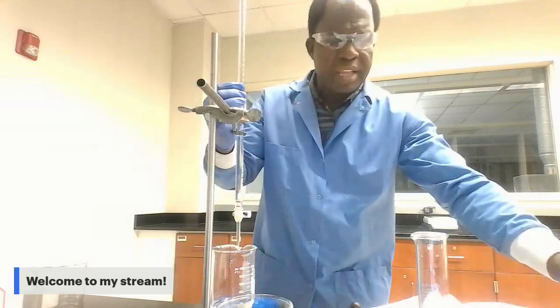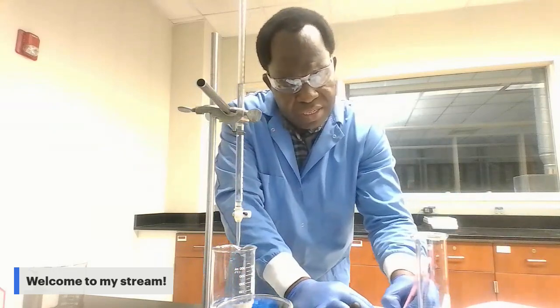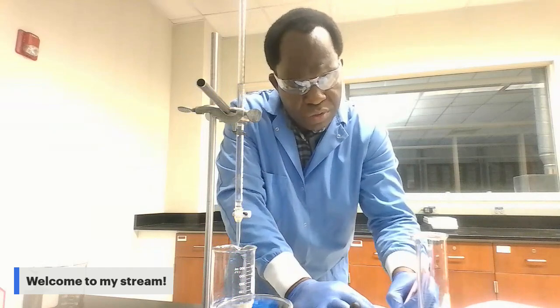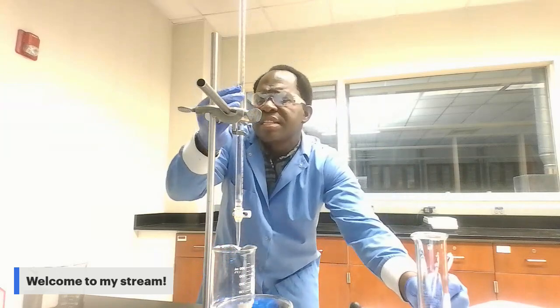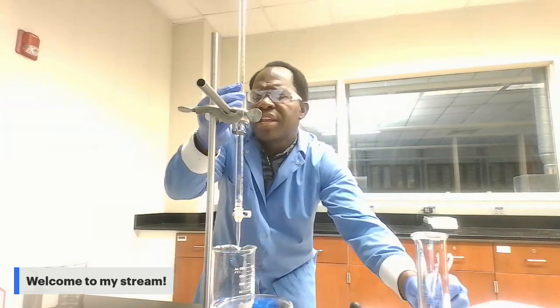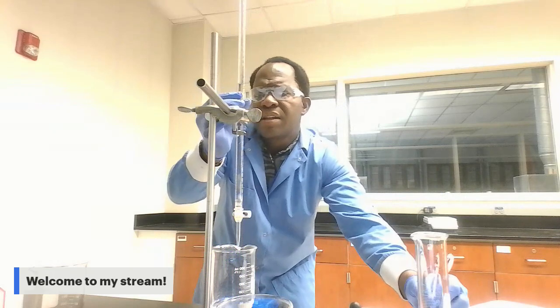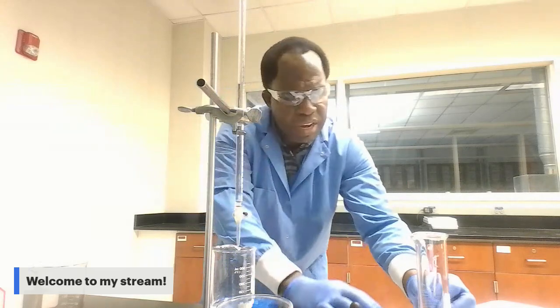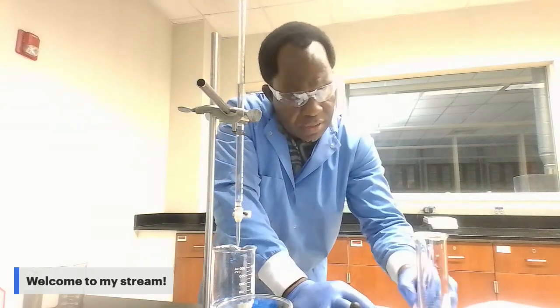Now, for the second titration, I move from volume of HCl 15 milliliter to volume of HCl of 29 milliliter.